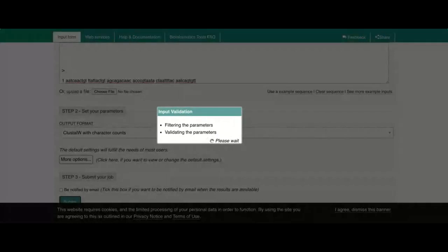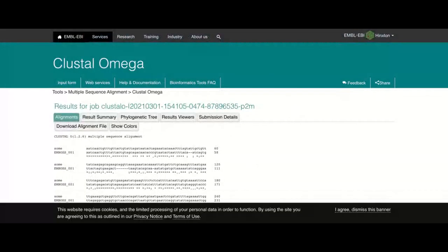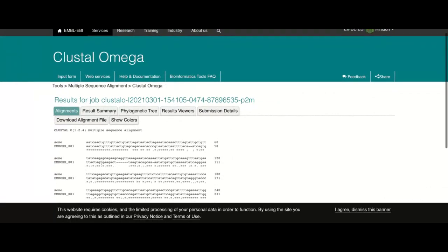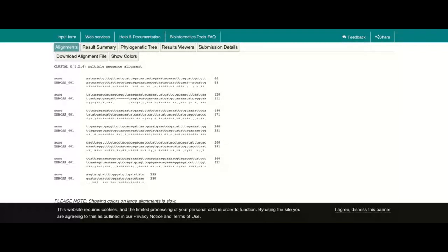So I'm doing the wrong way, just to show you. Oh, we did not notice, it thinks it's aligning protein. And okay, there is a bunch of matches, mostly because I didn't put a third sequence. So it's easier for 2 things to agree than for 3 things to agree. Here, this is the first word of my description, and then this is the code the computer decided to give when I didn't give it a name.